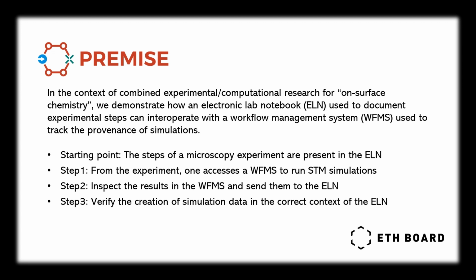It starts by showing the steps of a microscopy experiment, which are already present in the ELN. Then, from the experiment, a WFMS is accessed to run STM simulations. Afterwards, the results are inspected and sent back to the ELN. Finally, the simulation data sent to the ELN are verified to check whether they are in the correct context.